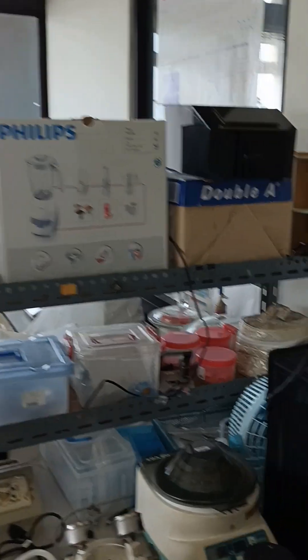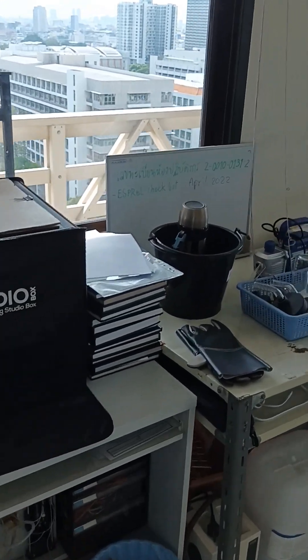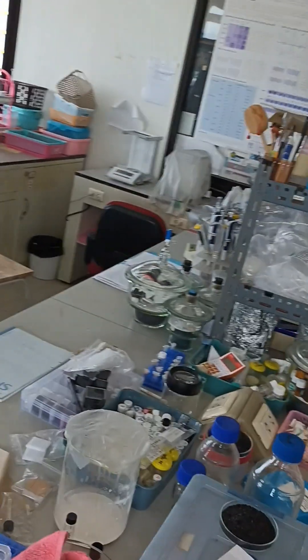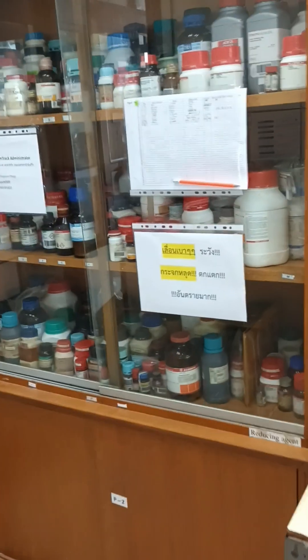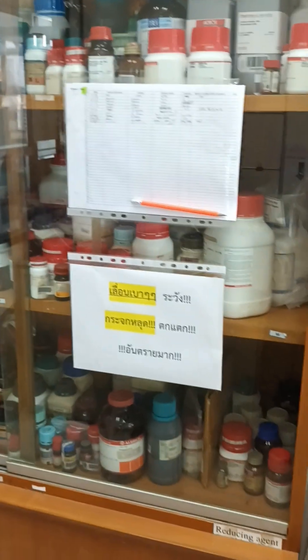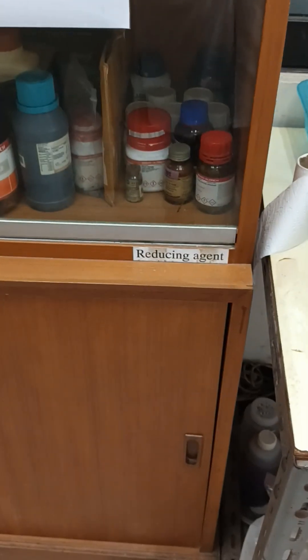This is our laboratory overview. This room is for synthesis only. Other instruments like ICP, AAS, UV — we have another room. This is the synthesis or sample preparation room. These are the chemicals we use in the laboratory. They are arranged according to their alphabetical order and according to their properties — for example, some of them undergo reducing reactions, so we can separate them here.